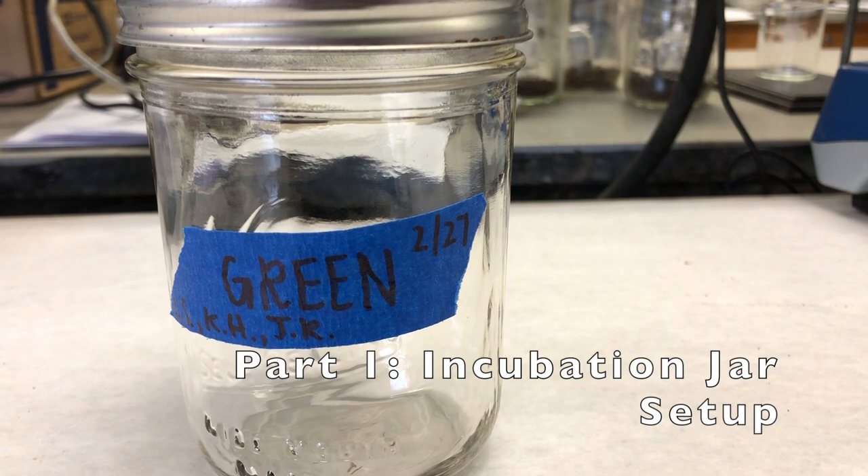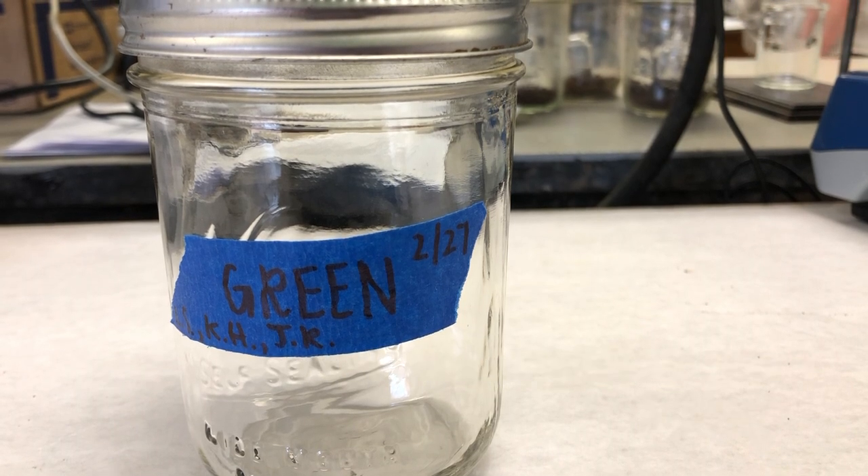To begin setting up the jars, label each of the three jars with the date, the researcher names, the treatment — either green, brown, or control — and any other pertinent information.